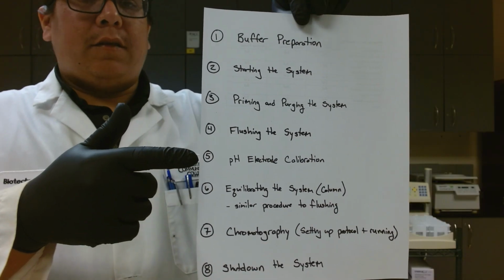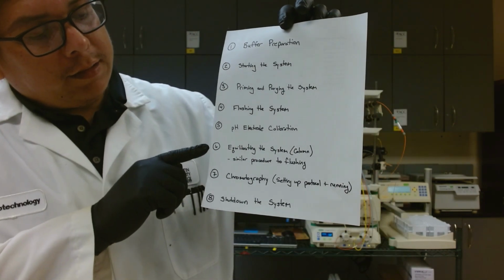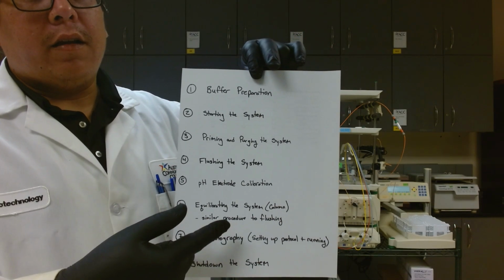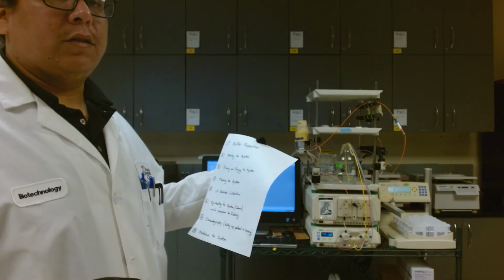Okay, so now that we've gone through and showed you how to calibrate the pH electrode, next thing we want to do is equilibrate the system. And so we're going to flush now the water out of the column, and we're going to equilibrate it with our running buffer. So for that, we'll just show you how to do that on the software.